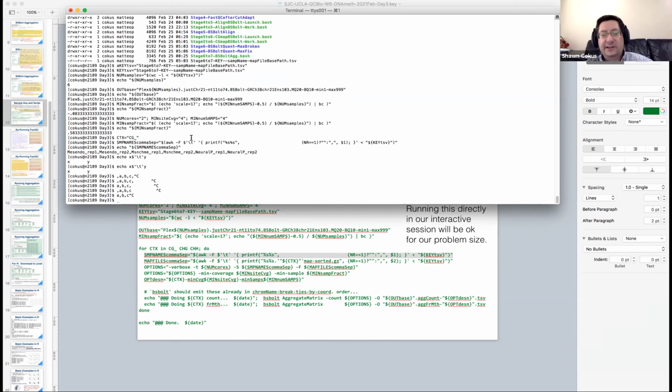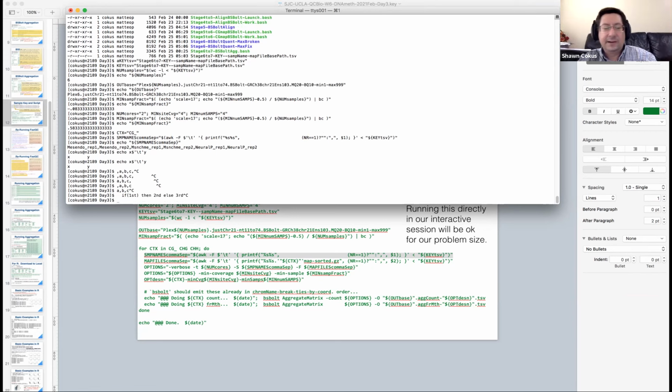So an easy way to do that in awk is that NR is a magic awk variable that tells you what line number you're on of the input file. And then ?: is a construct that actually comes from the C programming language. It's basically if the first thing, then second thing, else third thing, right? It's the same thing as first ? second : third.